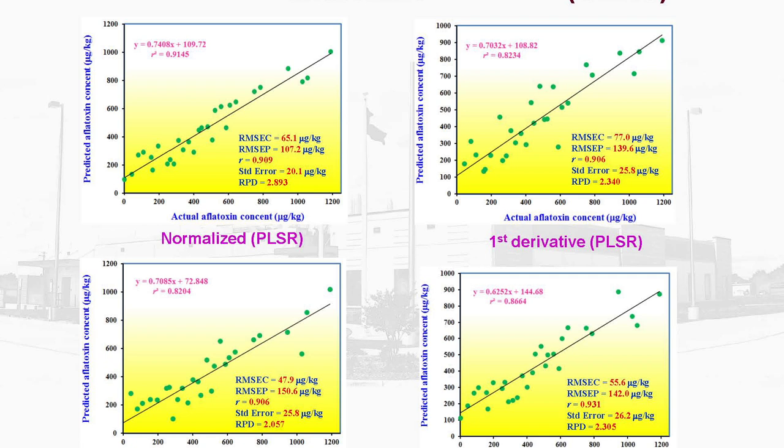And multiple linear regression models actually perform better than principal component regression, but not as good as PLSR models. And second derivative spectra and the deconvolution spectra improve the performance of models. And PCR models displayed very poor predictive accuracy. The slope of regression is 0.611, and validation is 0.7 at best.